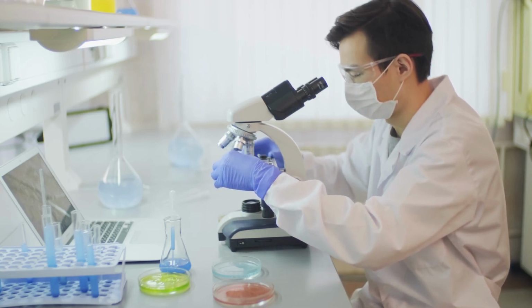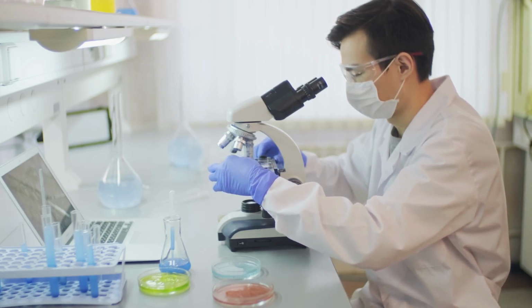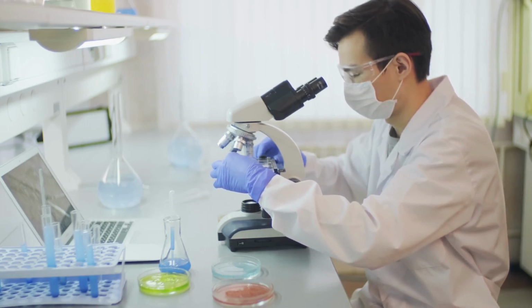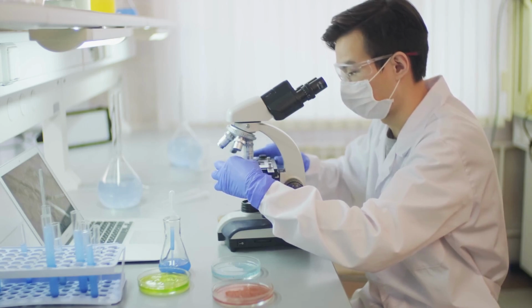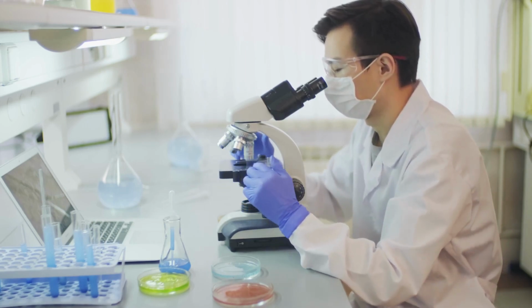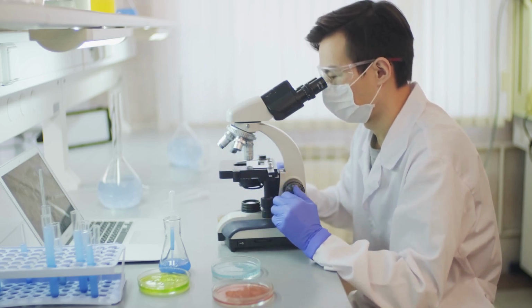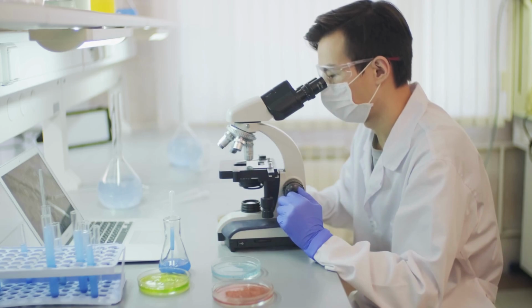2. Turn on the microscope. Plug the microscope into an appropriate power source and turn it on. Adjust the required magnification power by moving the eyepieces or controlling the numerical scale if the microscope is digital. 3. Sample mode. Open the stage or platform where you will place the sample. Carefully place the sample on the platform, making sure it is securely attached.